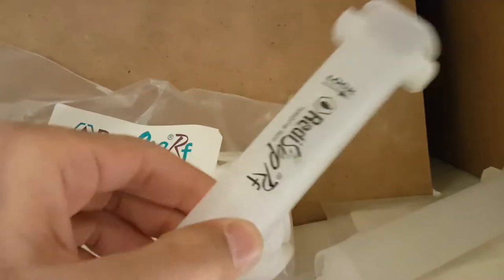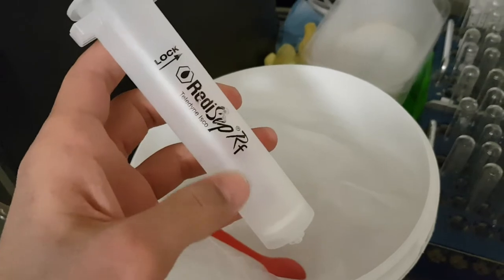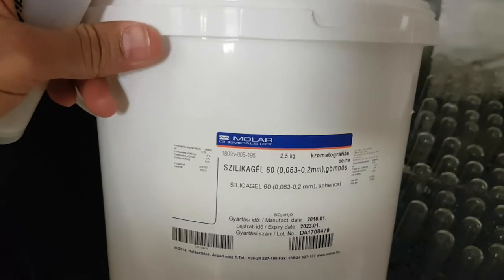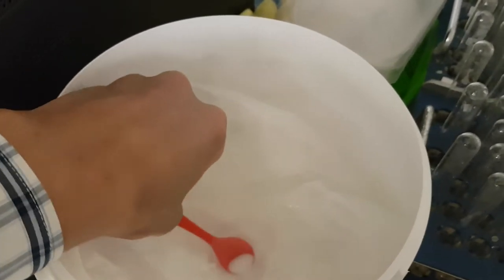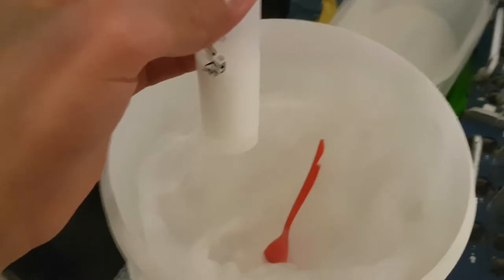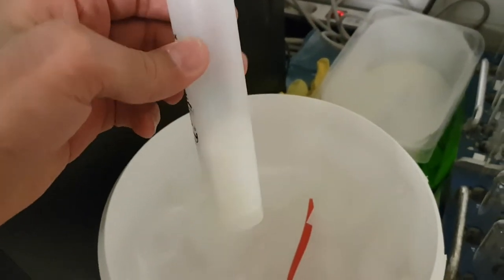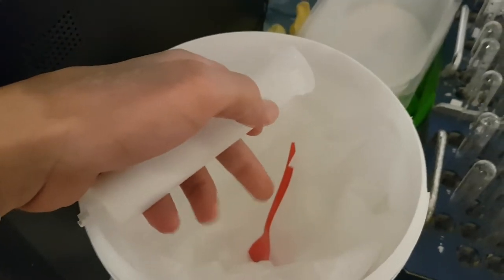Now we will load it with some silica gel. We can use this spoon. I think it seems to be enough for me. I just took some silica gel from here and I put it inside the cartridge.